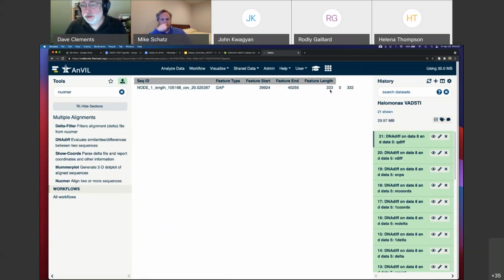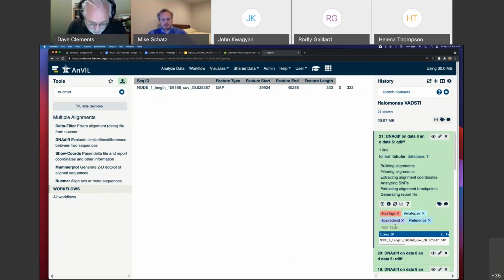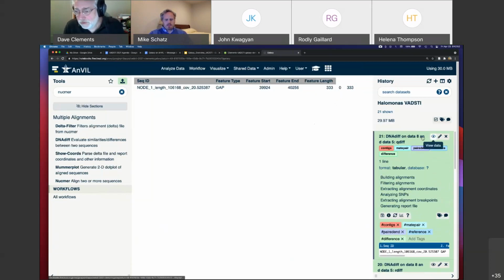Okay, a couple things I want to do now. I want to use this information to extract out that DNA, those 333 bases. And there's a couple things I have to do first to do that, okay? So that's what we'll do now. Before we do that, there's a couple of cleanup things I want to do. I'm going to add a tag here, say difference, because now I'm doing stuff with differences, okay? So I fold that in.